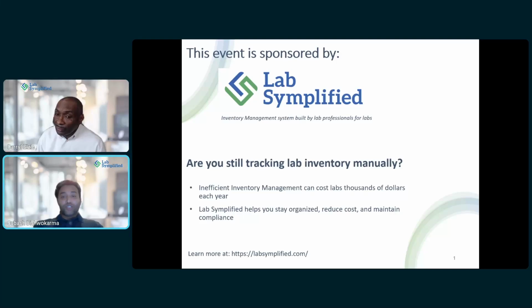And we chose the competency assessment as our topic for this webinar. The reason why we chose this topic is that competency assessments are such an important topic for lab professionals. It's not just a regulatory requirement, but also very essential in maintaining a high quality operation, ensuring compliance, and ultimately delivering accurate patient results.